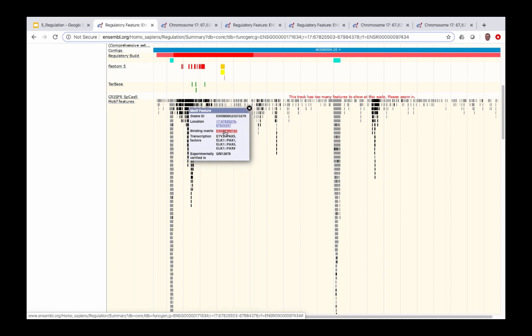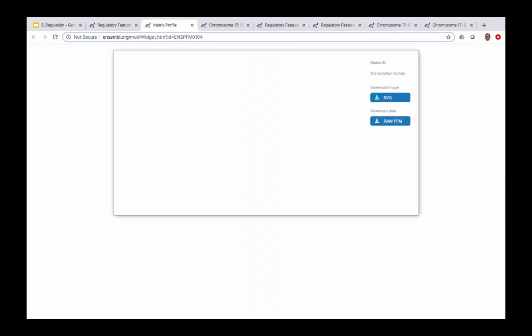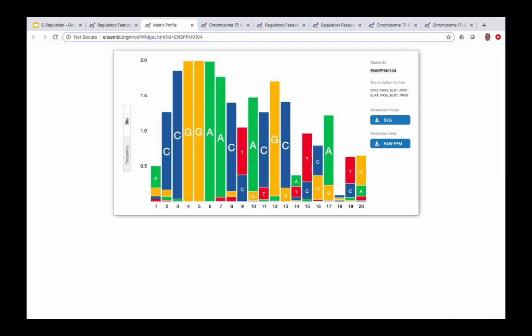Clicking on the binding matrix link opens a new tab in the internet browser displaying the binding matrix for this specific motif. We can see the frequency of the different bases observed at each position along this motif.